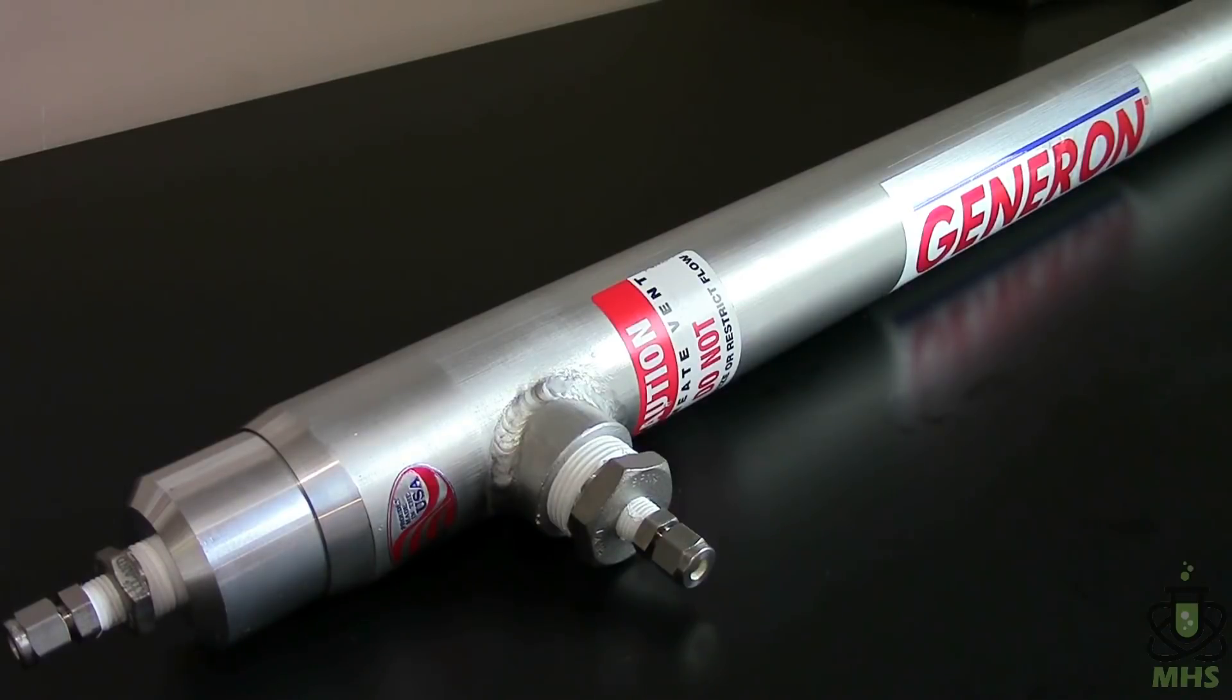Finally, I think it's important to note that this technology is meant to filter out oxygen. So other atmospheric trace gases that we mentioned before could still make it through. So when we say we're producing 99% nitrogen what that really means is that there's 1% oxygen in the output stream. Your actual nitrogen purity would be more like 98% since you've got that 1% of argon that might stay with it. But for most applications that really doesn't matter because if your goal is an inert atmosphere 1% of another inert gas is not going to make a difference. It's still something to be aware of though.